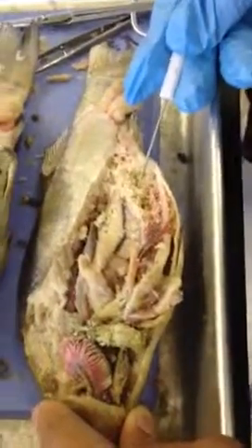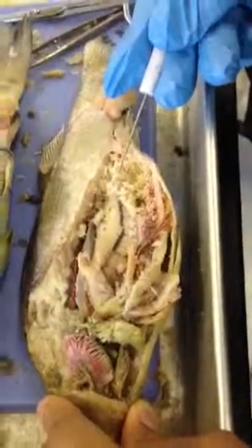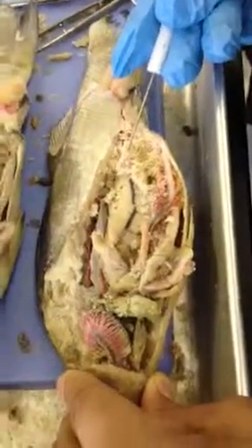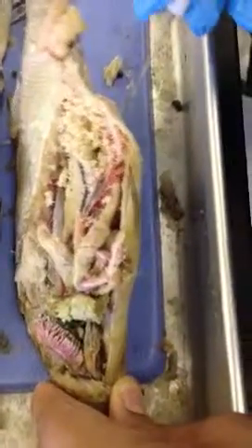And there's another one back here. So it's kind of cool. So these are the ventral gonadal arteries. And of course, this is the vent back here. And I think we finished everything. Perfect. Bye, guys.